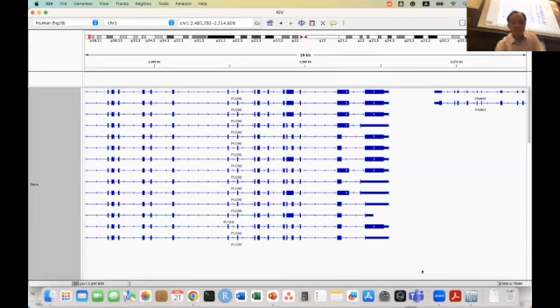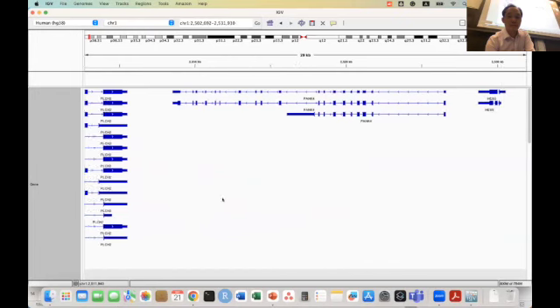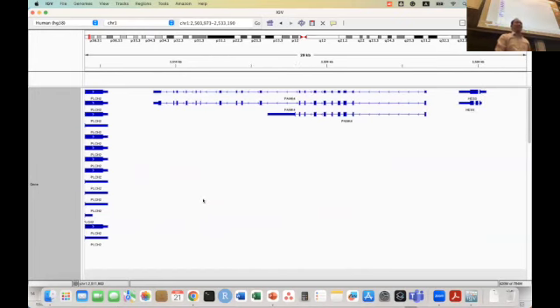Now I'm going to focus not on this gene. I want to focus on the other gene. The gene name is PANK4. Even though you can type the coordinate, I don't know the coordinate. So what I'm going to do is click and move it to the center. Can you move this PANK4 to the middle? Did you move this PANK4 to the middle?